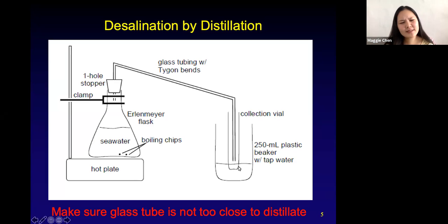Yeah, and it makes a loud noise too. It's not dangerous, but it could scare people. So that's one thing in lab. We would want to make sure that the glass tube, rubber tube, whatever, is not too close to the distillate.